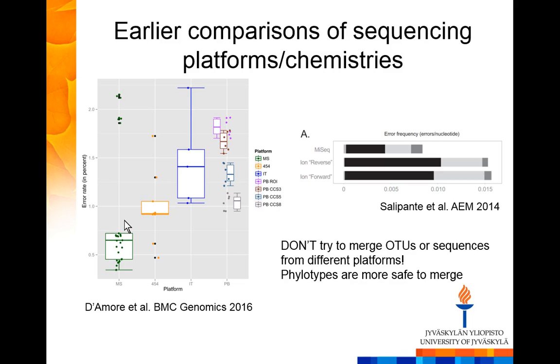When I was in the Fierer lab, they were just wrapping up this 1,000 homes comparison. They had the inhabitants collect dust samples themselves from the outdoor door rim, I think it's called, what's above your door, and the indoor door rim. So the outdoor microbiome and indoor microbiome. And they did most of the sequencing with HiSeq, because when you have 2,000 samples, that's the sensible thing to do economically.